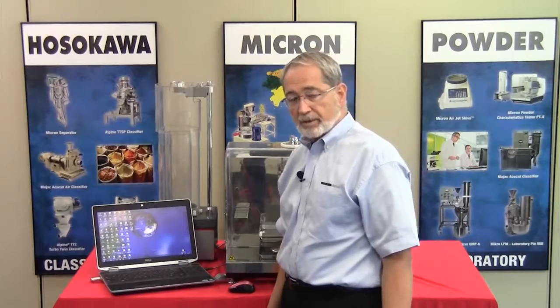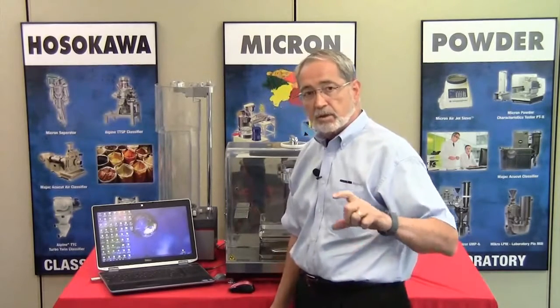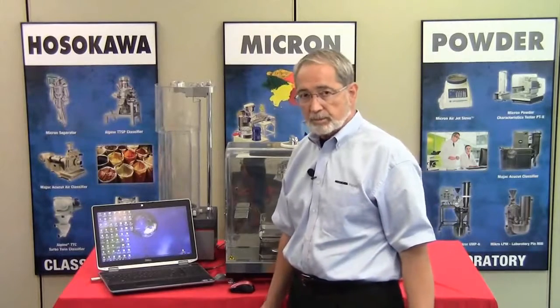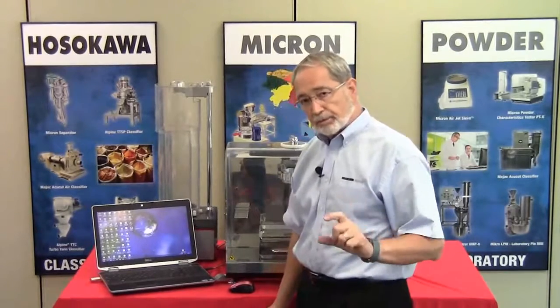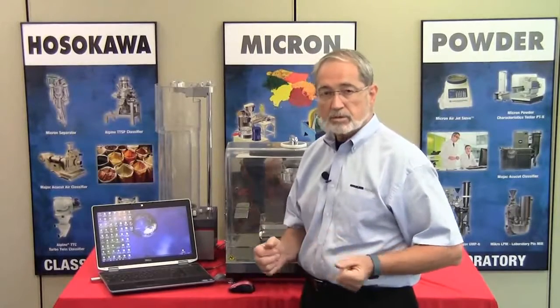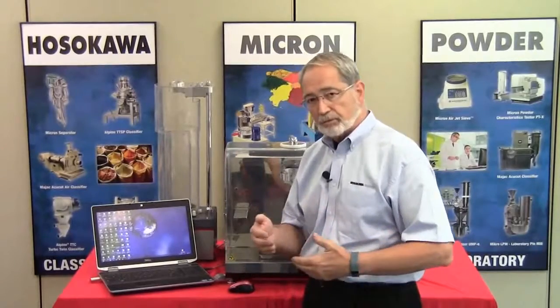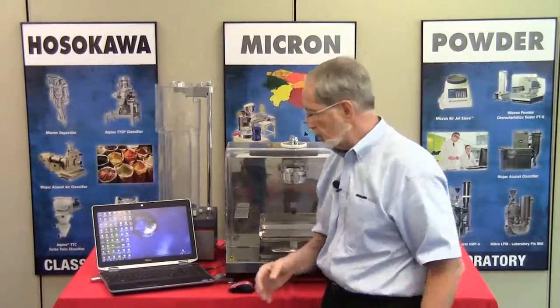I'm with Hosokawa Micron Powder Systems, and today we're going to talk about the operation of the powder characteristics tester model PTX. What we're going to do is show you the operational startup sequence so that once you have your instrument, you can follow through and perform the various tests that are required.